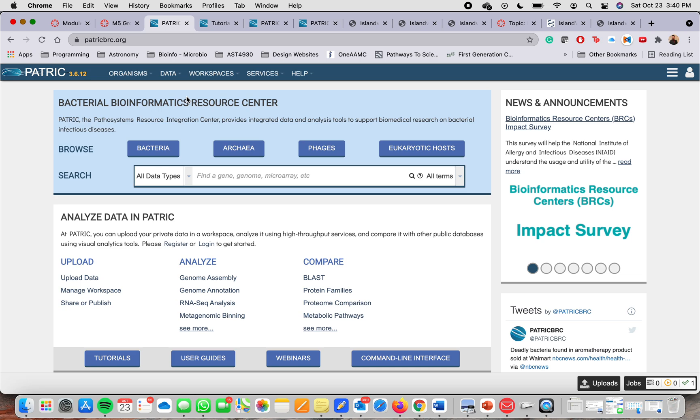The way that it works is that you can upload your own data and then you can compare that data with public data out there, public databases using visual analytic tools.